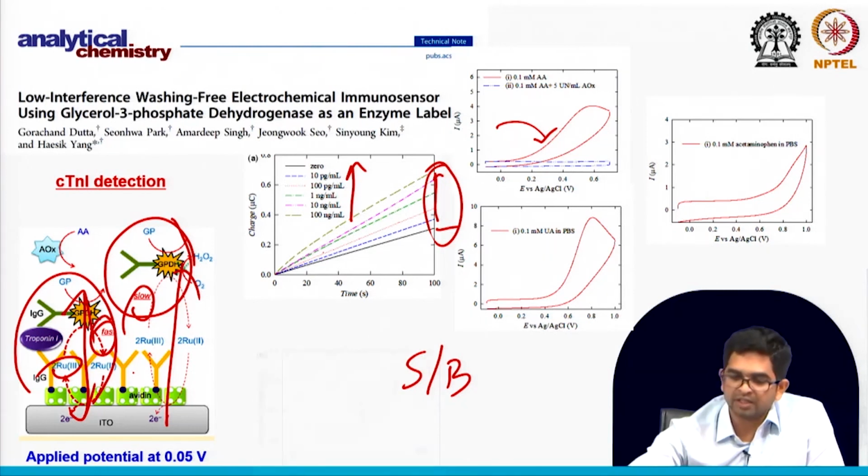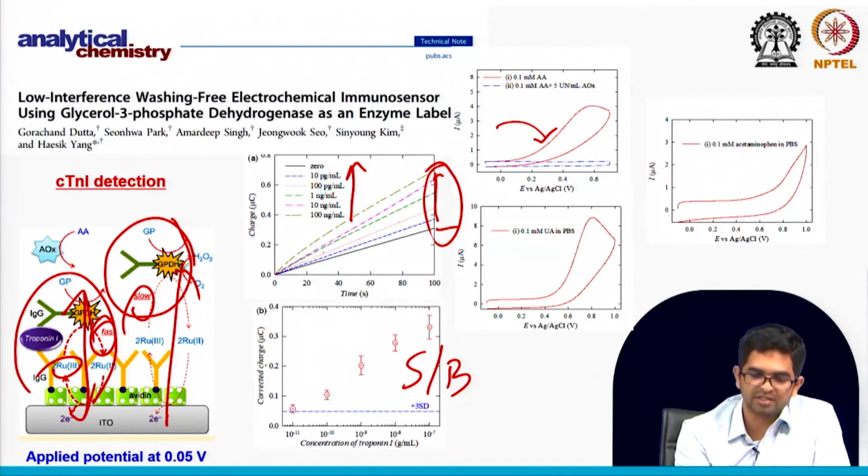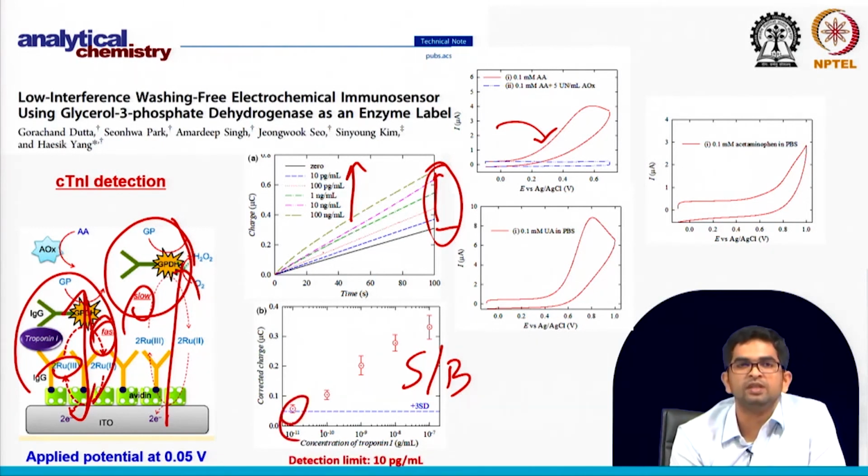Okay, and we measured, you can see the calibration curve here, and from here the detection limit is almost 10 picogram per ml, not femtogram per ml, because as I said, the background here is a little bit high. If you want to improve further, you have to think about how to minimize the background current.